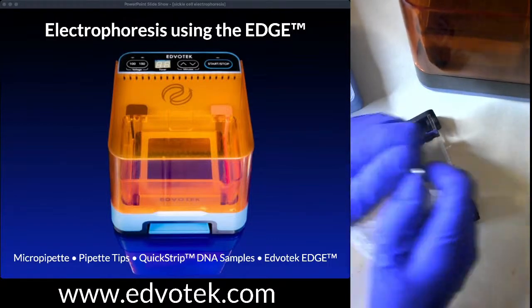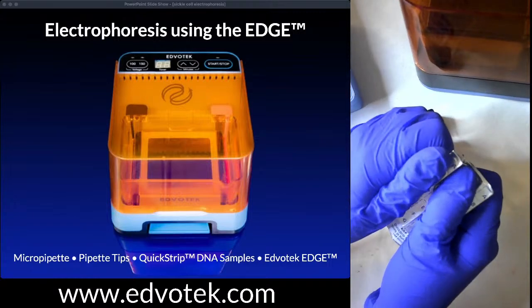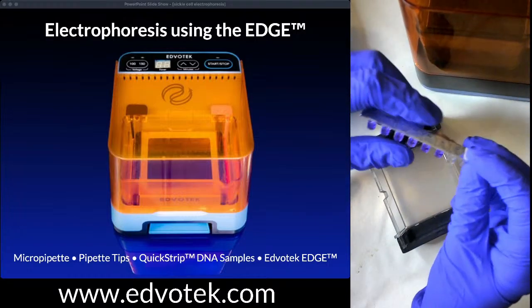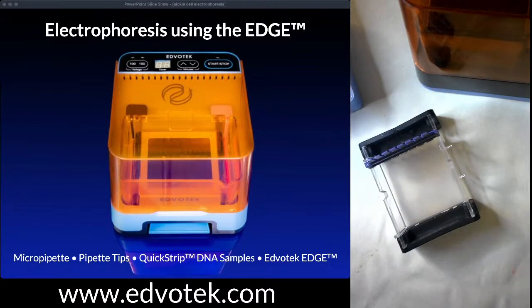And the nice thing is that the samples are pre-aliquoted, and that means that I just take one of these strips. We're going to give one of these to each of our groups, and that's all the prep you need to do on this end. So super easy way to do electrophoresis.